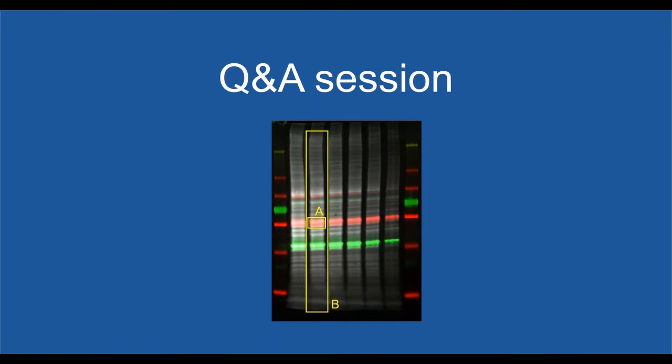We have a question from Azim as well. I'm not sure whether I answered this before. How would you normalize protein of interest over total protein bands? Correct me if I'm wrong here. It seems to me total protein will stain all the protein of the blot, like how we did with Ponceau S. Quite interesting to use total protein as an alternative to housekeeping protein.